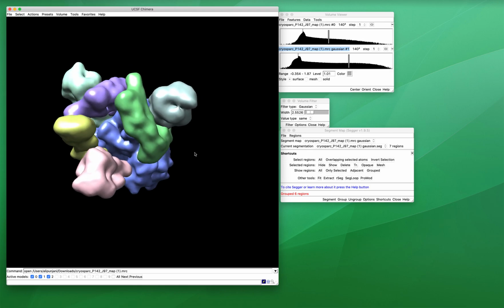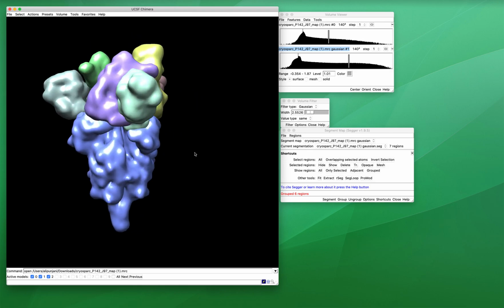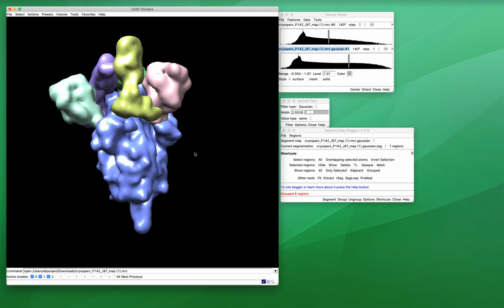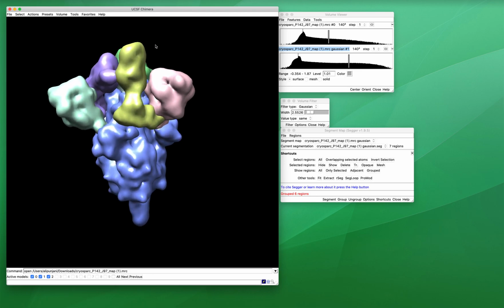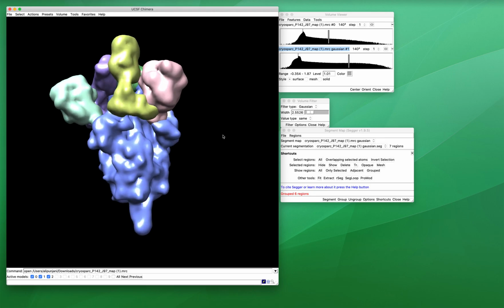Of course, you can make this segmentation more precise or better and spend more time playing with it, but as I mentioned, the boundaries really do not need to be precise. They're just coarse boundaries that need to separate our domains, and that's all that's really of importance here.